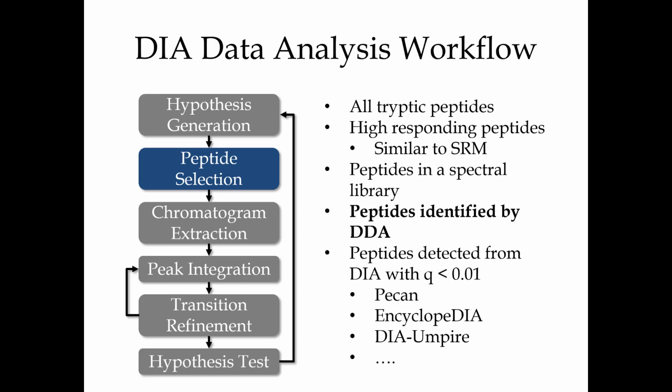We're just going like, okay, we've got comprehensive sampling of this space, and now we want to go and extract chromatograms, and so it doesn't matter if there's highly convoluted data with a bunch of ions in there.